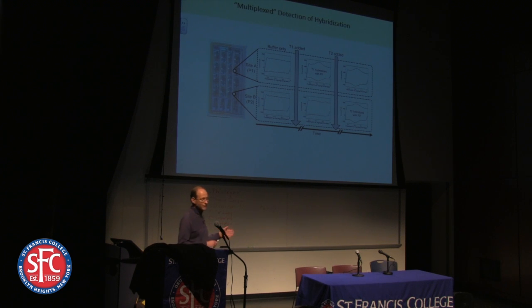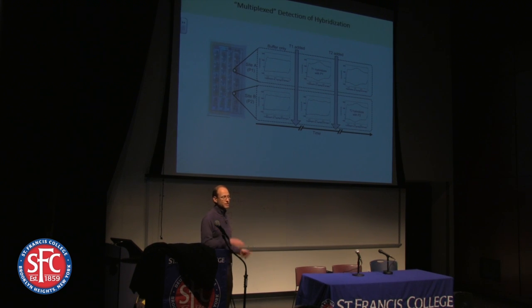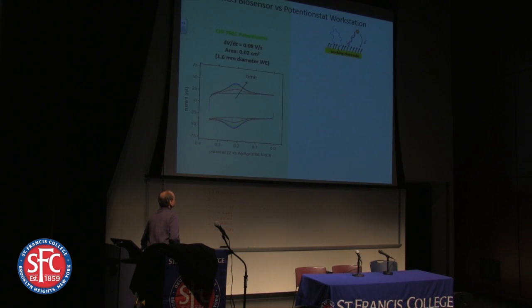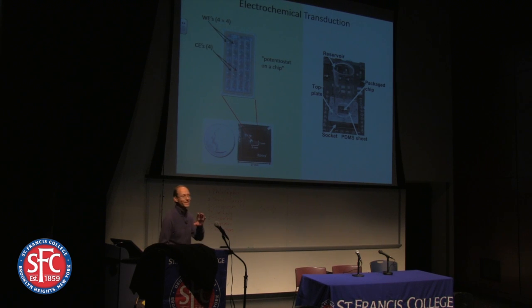In our case, for biosensors, I always think of those as operating in real time or under a liquid environment. So you design your experiment so that you can actually keep the liquid in contact with the surface of the sensor the whole time. Yes, but we do it carefully.